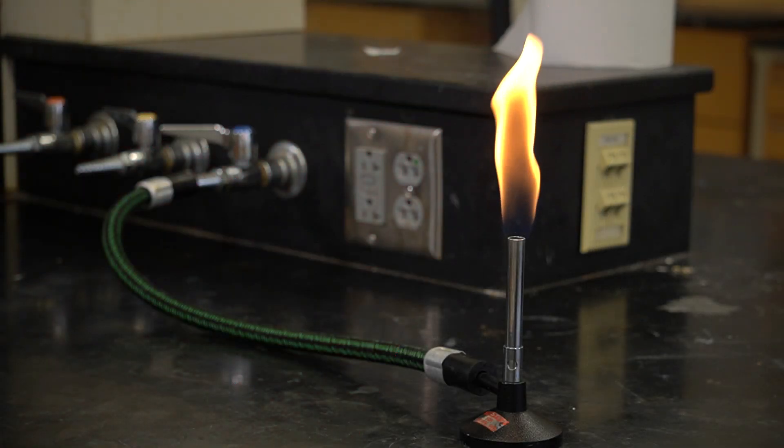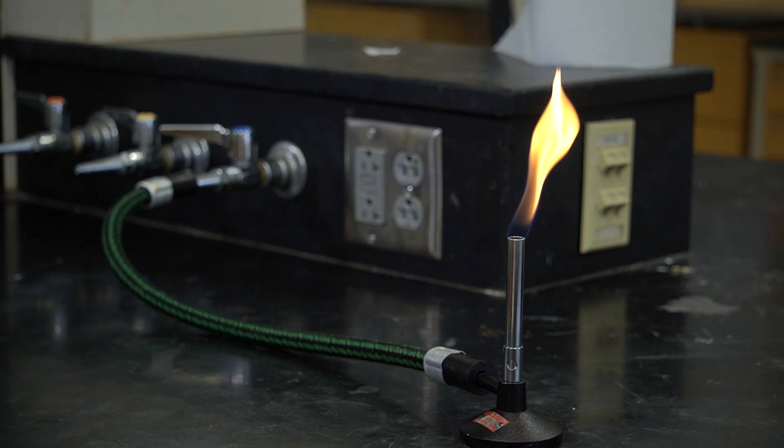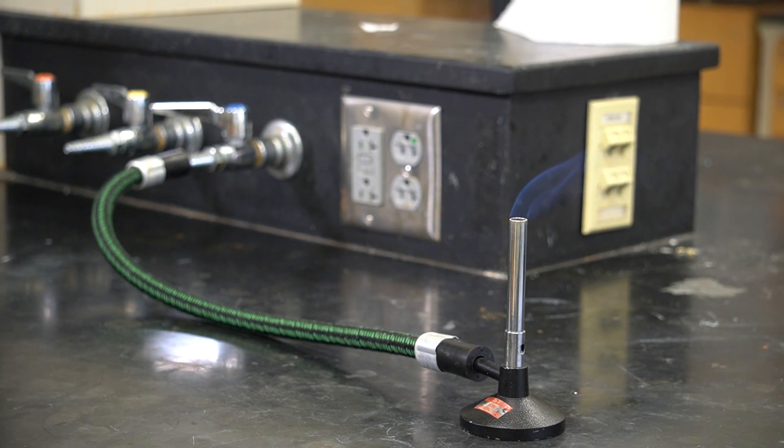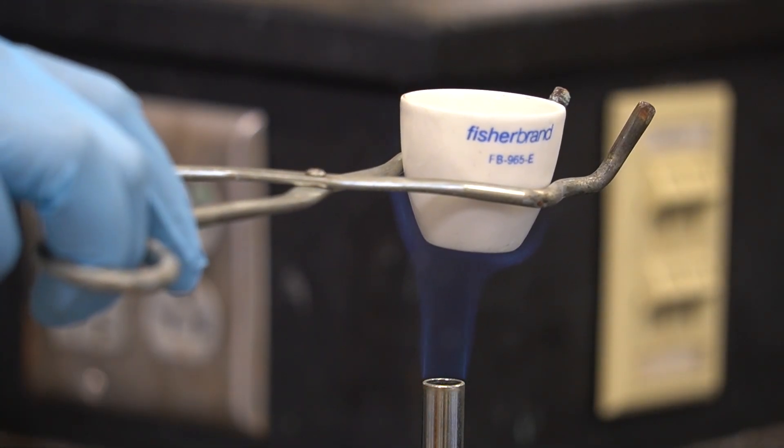In this video, we will discuss how to safely set up and light a Bunsen burner. Bunsen burners produce a single open flame and are used mostly for higher temperature tasks, such as conducting flame tests or heating a ceramic crucible.